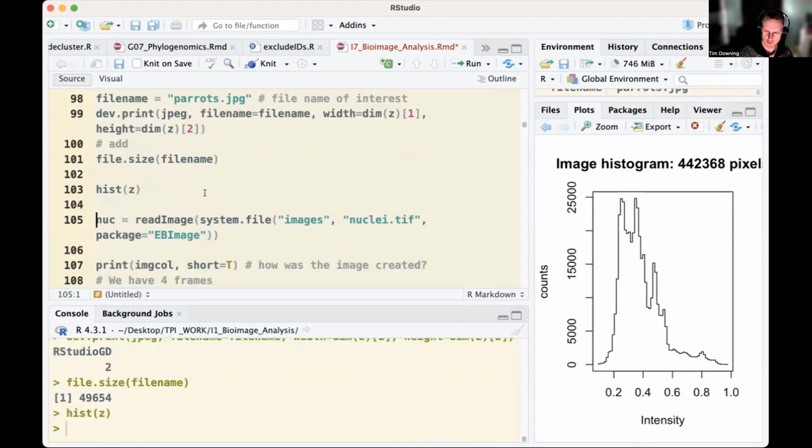So you can see there we have a distribution of values. So you can see a lot of them are in the middle. That's also useful then if looking at a microscopy slide where a lot of it's very dark with certain things highlighted. This becomes quite useful because we see the spectrum of intensities there.